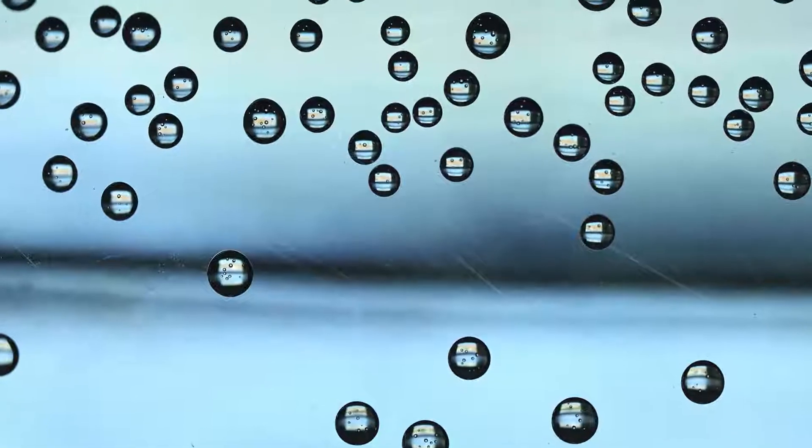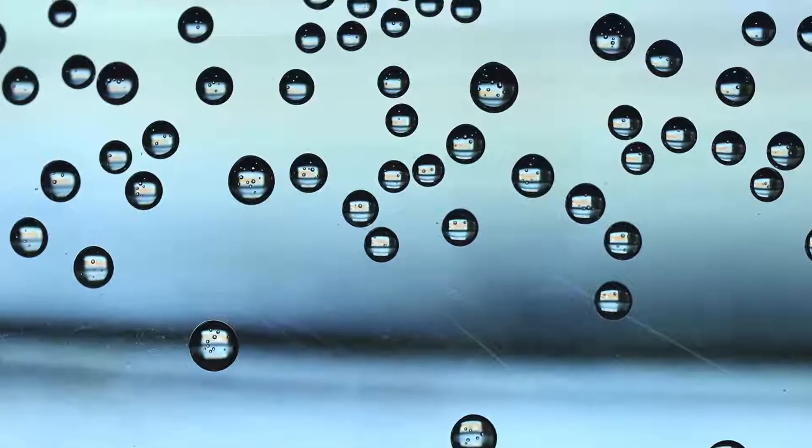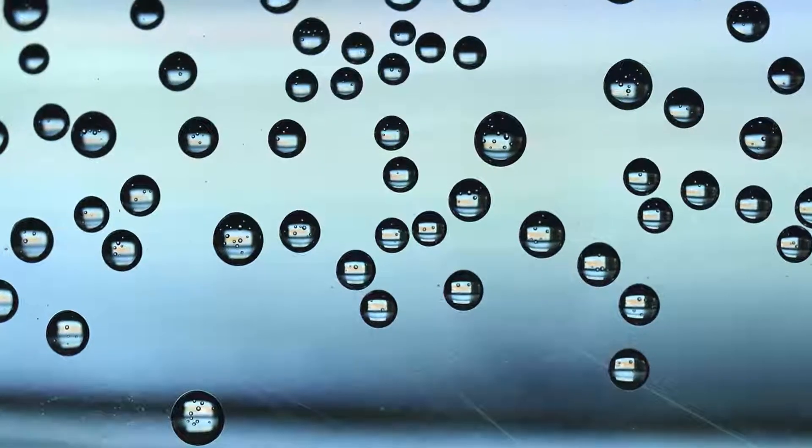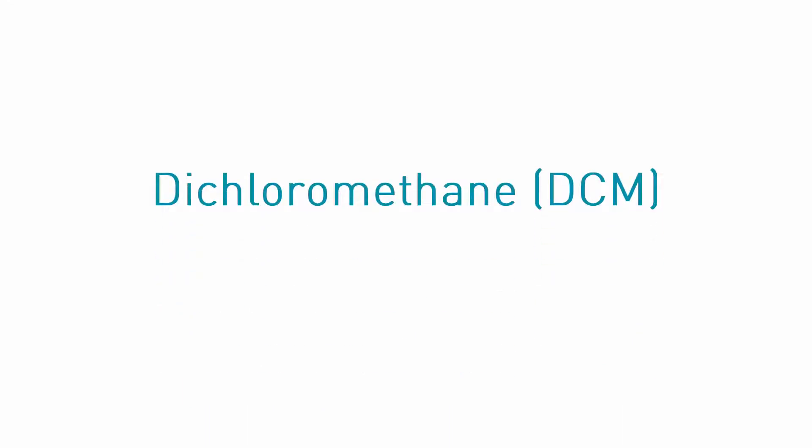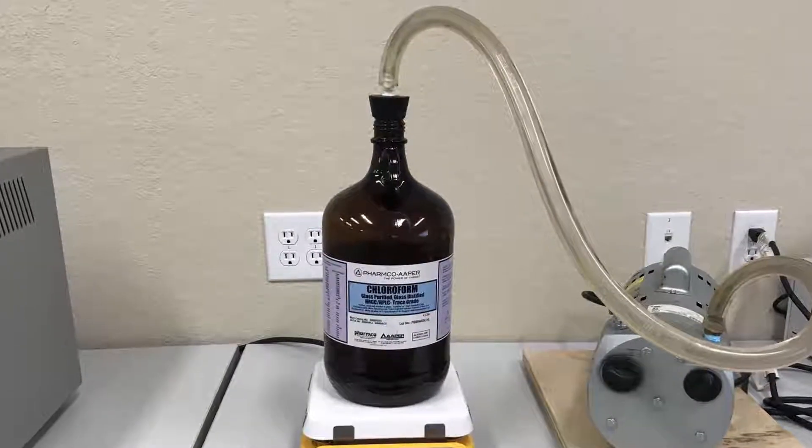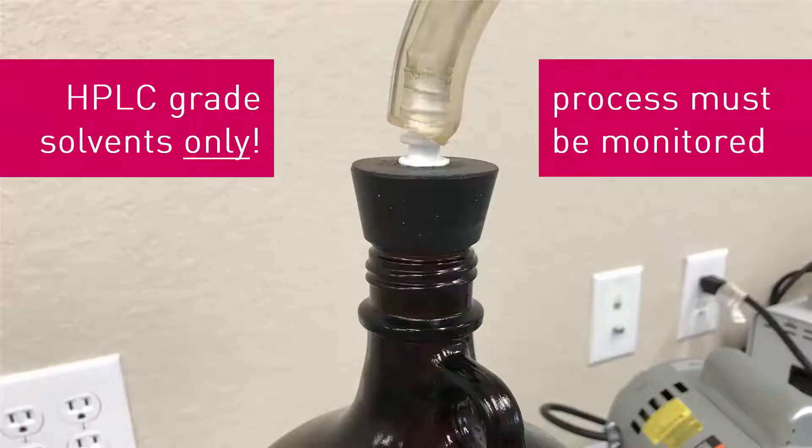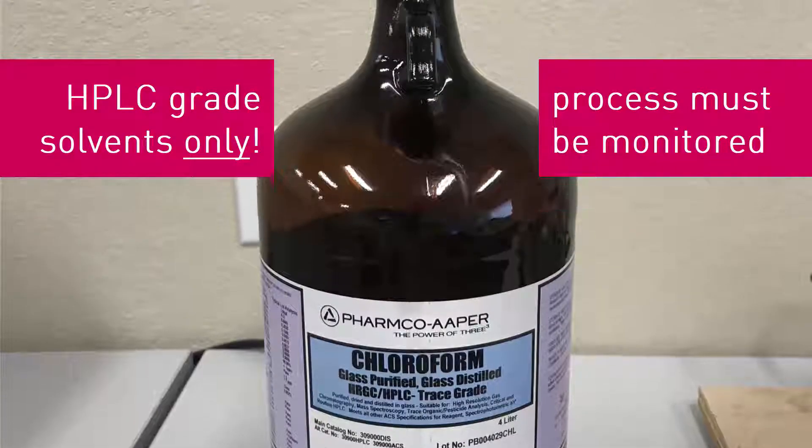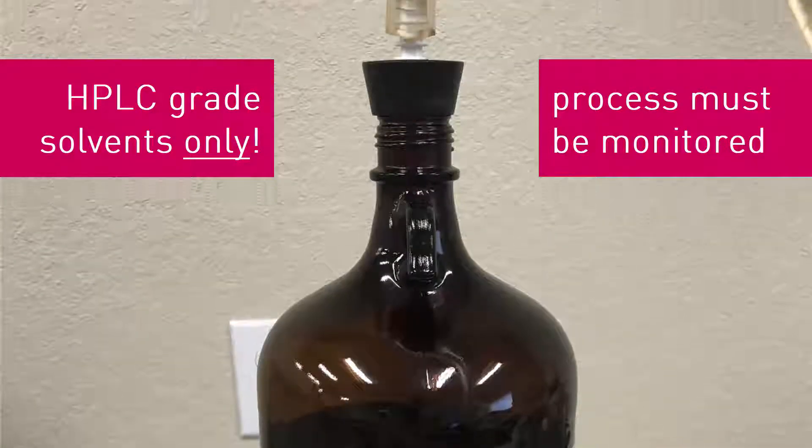As an aside, if you're using an HPLC-grade solvent that contains a lot of dissolved gas, such as dichloromethane or chloroform, you can thoroughly degas the solvent by placing the bottle under vacuum while being stirred. This process must be monitored closely and should not be extended for more than a few minutes at most to minimize solvent evaporation.